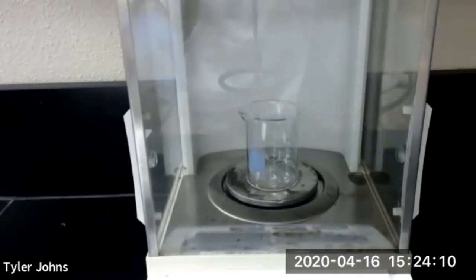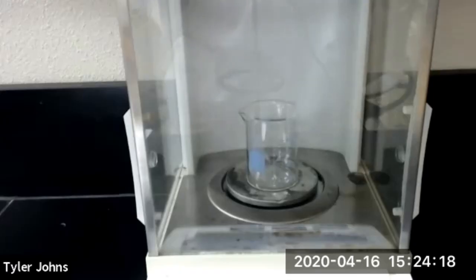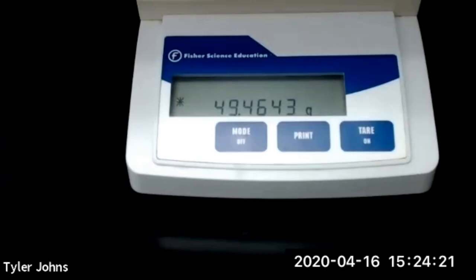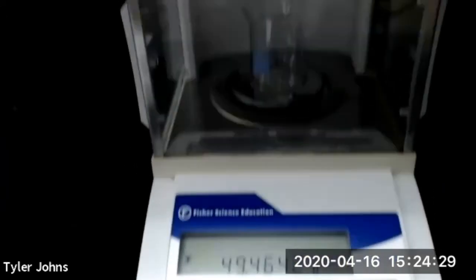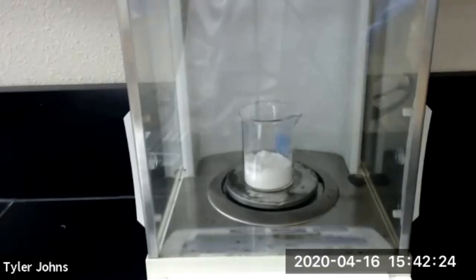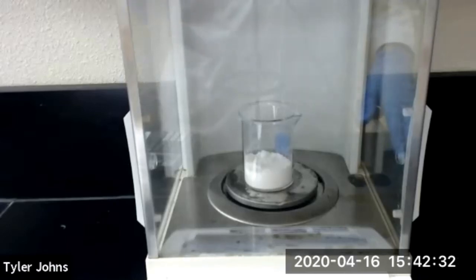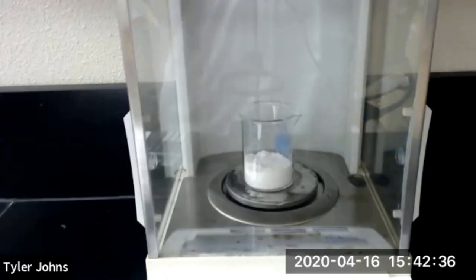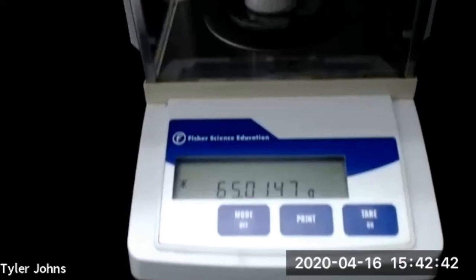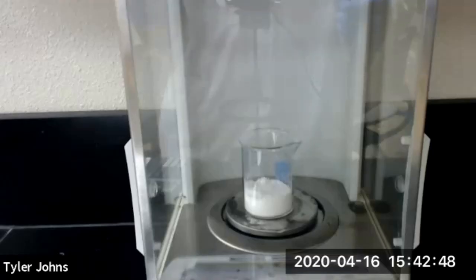So as our alum is drying, we're going to go ahead and pre-weigh a 100 mL beaker. So here's our 100 mL beaker, and the mass of our beaker is 49.4643 grams. Okay, so we've let our alum dry and I transferred it to our pre-weighed 100 mL beaker. So now we're going to determine the mass of the alum plus the pre-weighed 100 mL beaker. The mass of the alum plus the pre-weighed 100 mL beaker is 65.0147 grams.